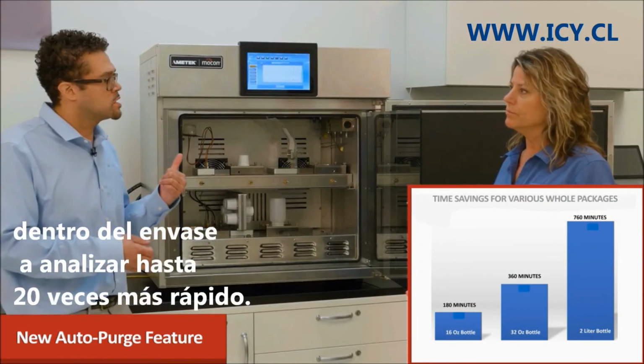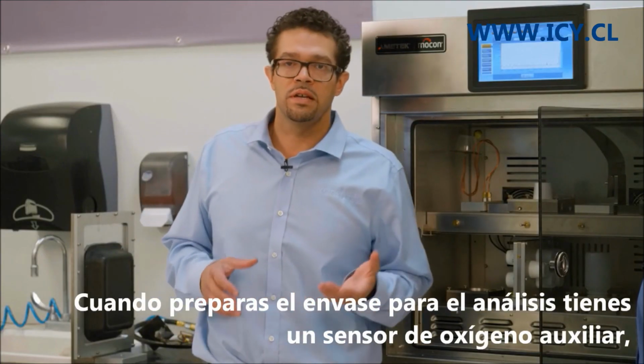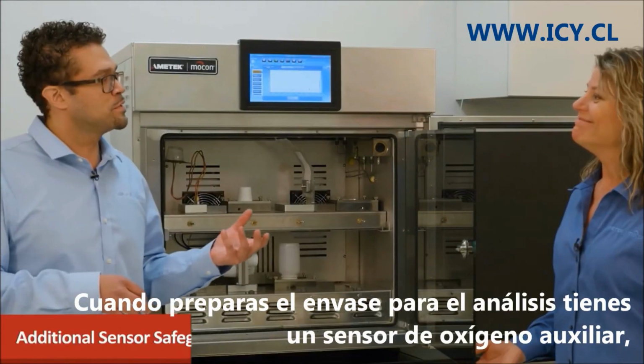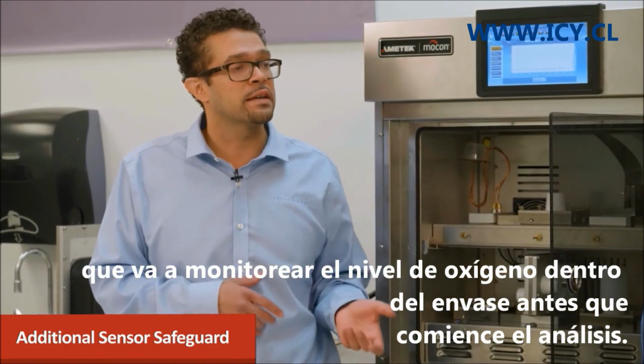Really good. So we really speeded it up on that front. And then also we have the conditioning in the quick check. So when you set your package up for conditioning, what will happen is you have an auxiliary O2 sensor that will monitor what the oxygen level is within that package before it inserts it into an active test.